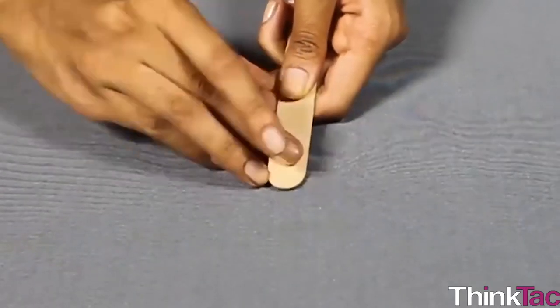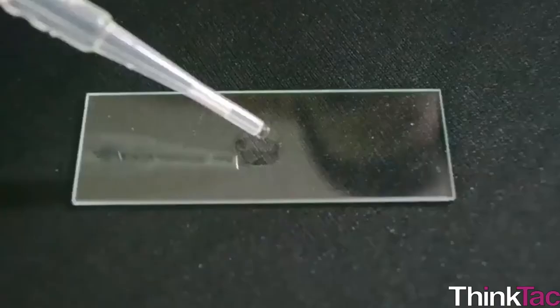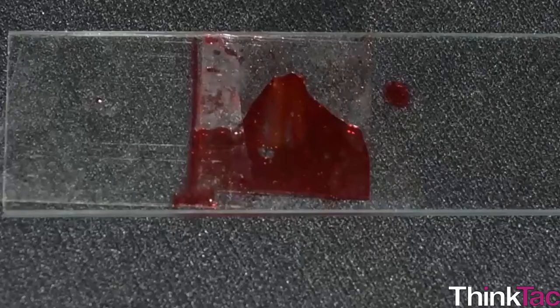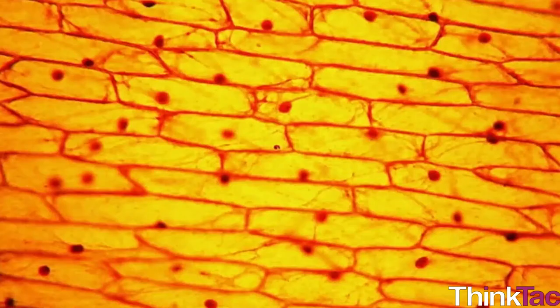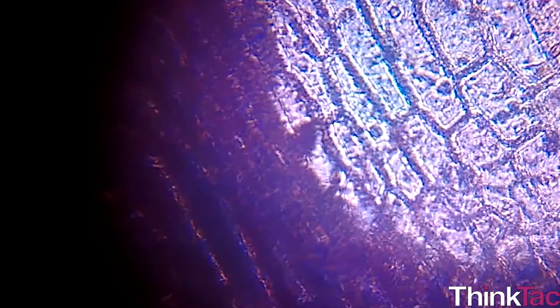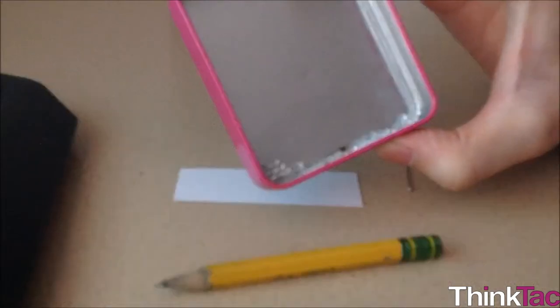By now you might have figured out that this fun activity is not really one but two fun activities: one, making the microscope itself, and two, using it to look into onions. Choose a good glass bead and mount it on a piece of cardboard, and now you can discover how things that are too small for our eye to see actually look.